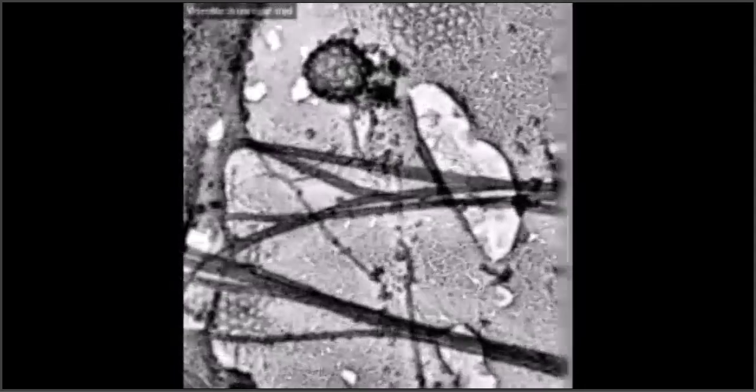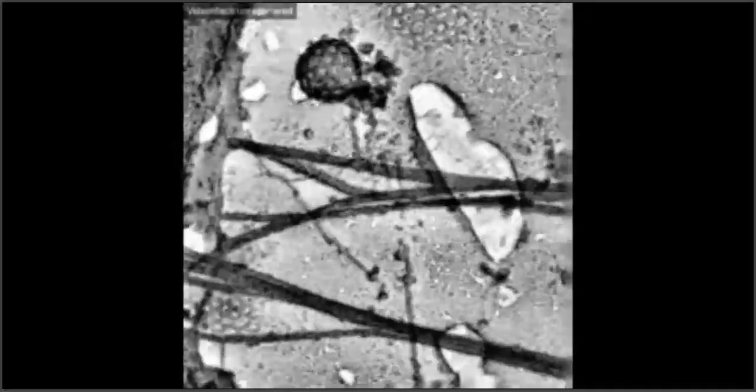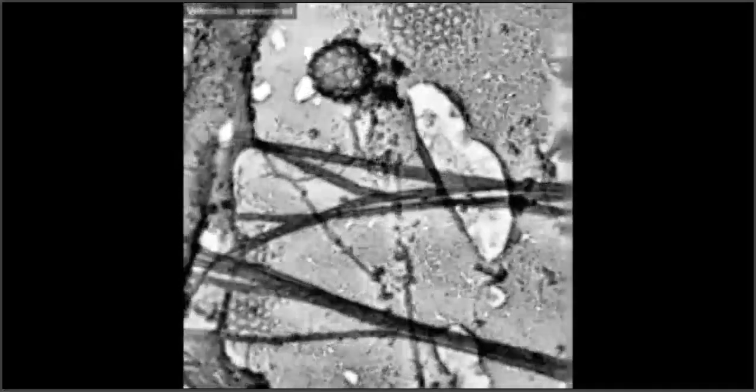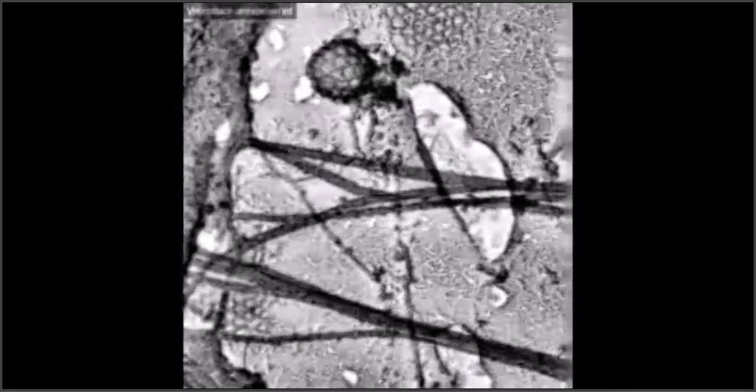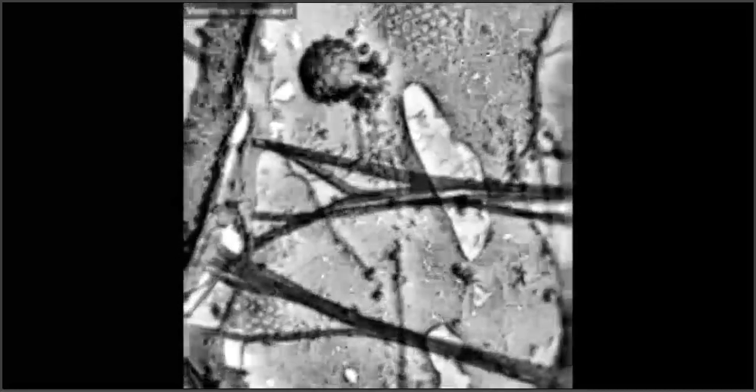She does work that I consider more art than anything, because what she's done here is crack open a cell and preserve the materials that she's interested in within that cell. This is the leading edge of an epithelial cell that's undergoing endocytosis. And what you can see here at the very top is a clathrin-coated budding vesicle. That's the round thing in the top left-hand.